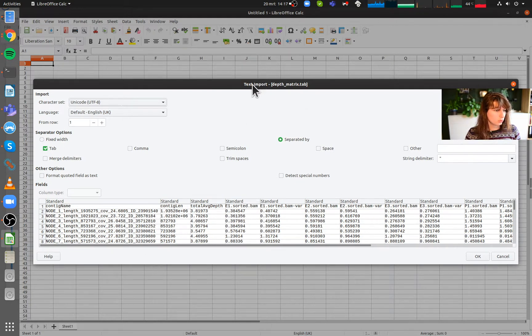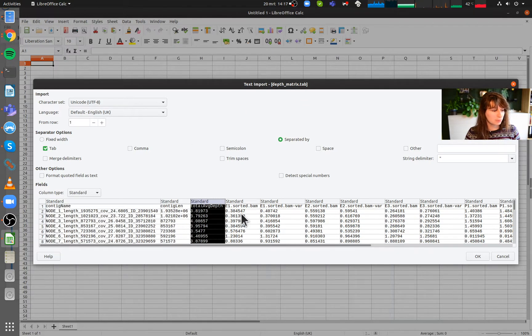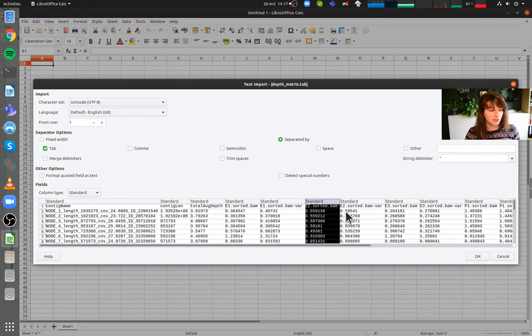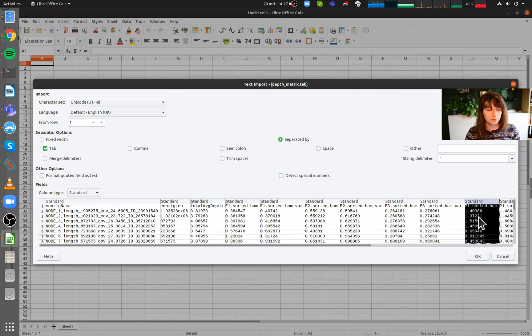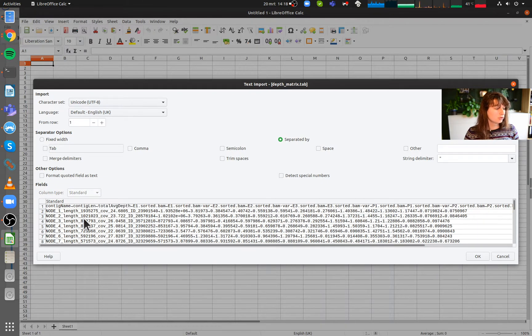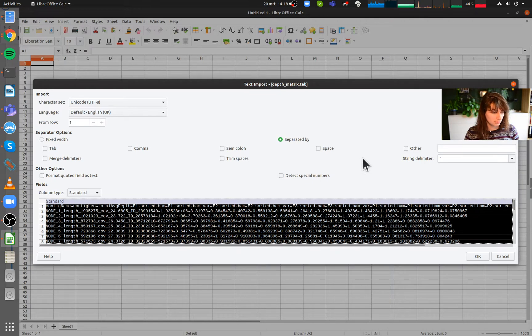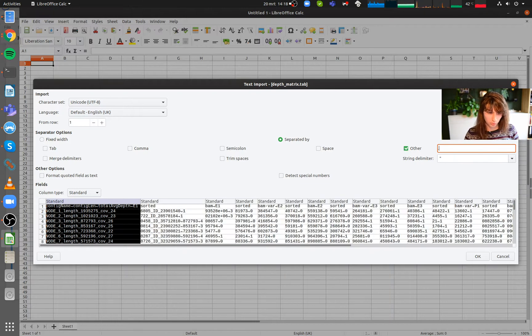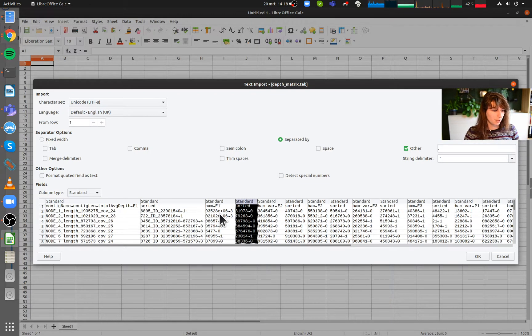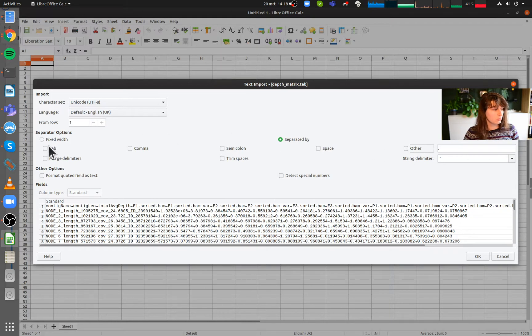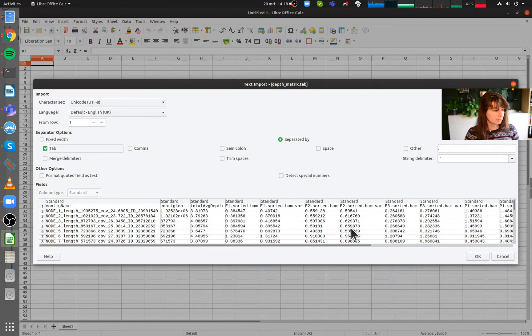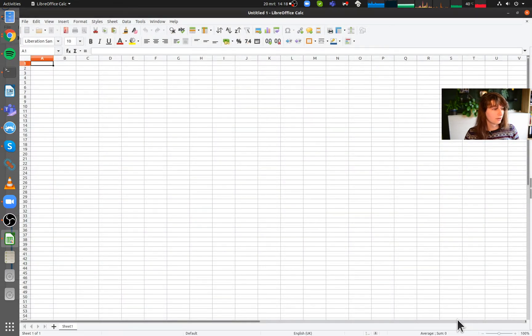This is a text import dialog. It gives you a preview of how the text is imported. The important thing is that data is imported into different columns. This is a tab-delimited file, so the Tab checkbox has to be checked. If it's not, everything becomes just one big column — a mess. We want the tabs selected. It should recognize this by default.